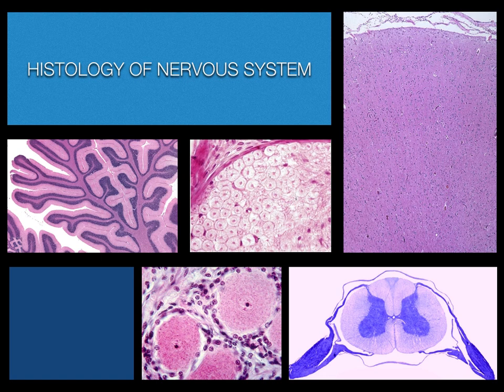And those are the organs you will be studying in the laboratory today. This video serves only as a guide, and you must study the actual slides on your own.